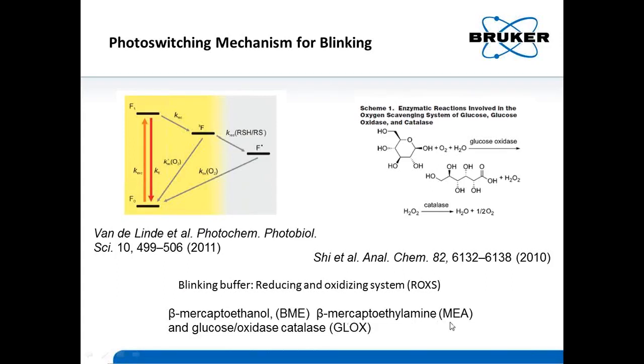These are both thiol molecules, which can act as reductants. And then here's a schematic for a glucose oxidase catalase system, so that you're depleting oxygen, and then releasing it in a controlled fashion so that you can affect these transitions back to the ground state.